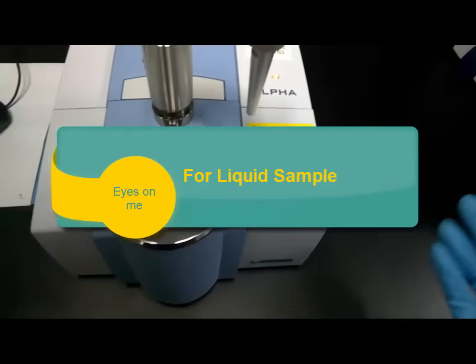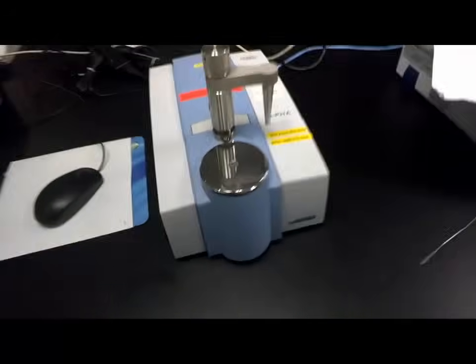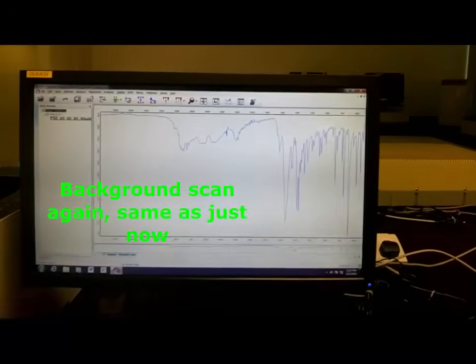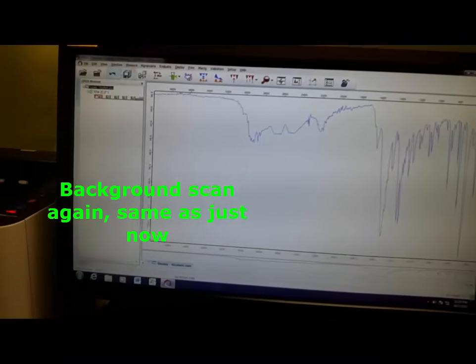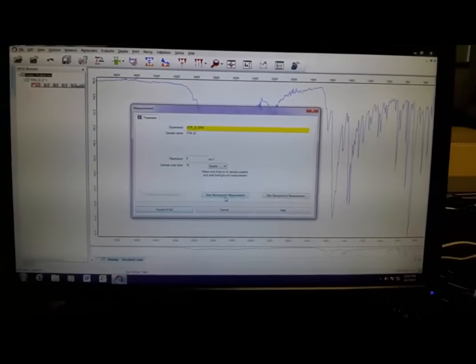So right now for liquid sample, make sure that this is clean — there's nothing there — and we do a background scan. So we continue with the next scan. Back to measurement, click the middle button, start background measurement.